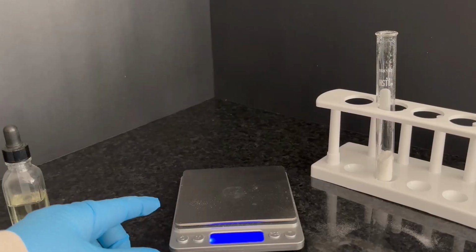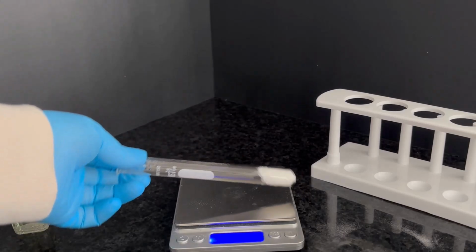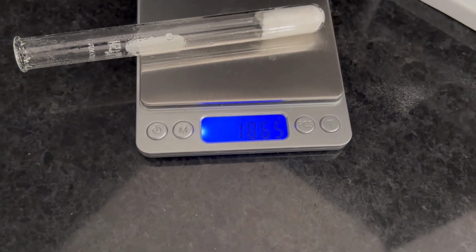After letting the test tube cool, we'll take the mass of the test tube and the powder product again. This is our actual or experimental yield.